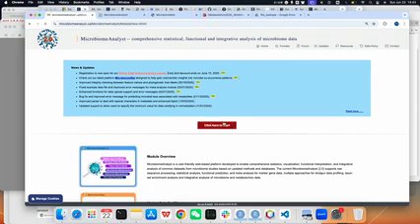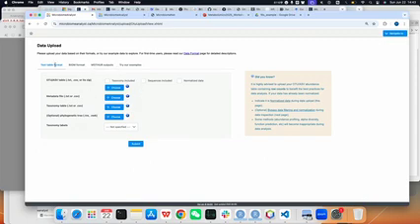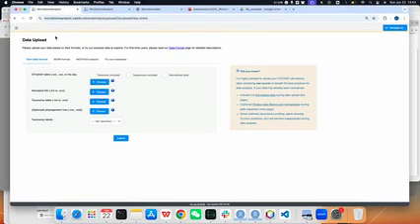You just click Start, and then click this module. You can see that MicrobiomeAnalyst actually accepts different formats of input data, so you don't get too overwhelmed by the data format. Here I just simply introduce the basic information we need to upload in the website using the plain text format. Except the phylogenetic tree, all these three files are mandatory. First of all is the ASV abundance table.